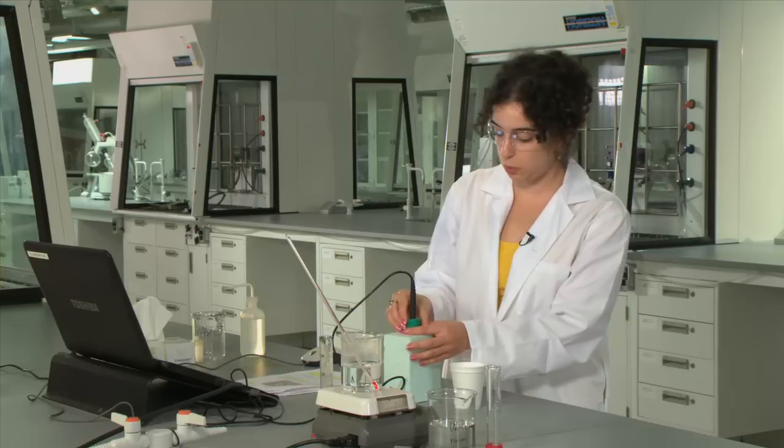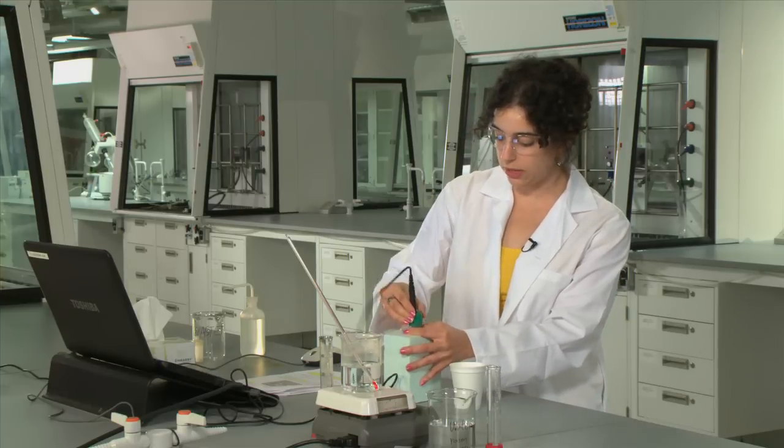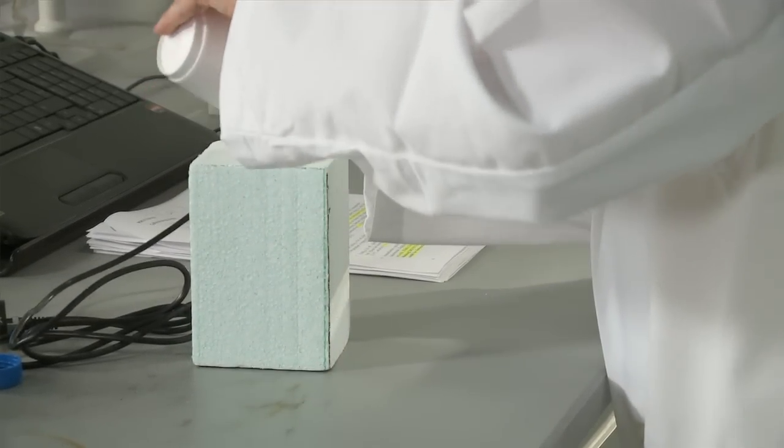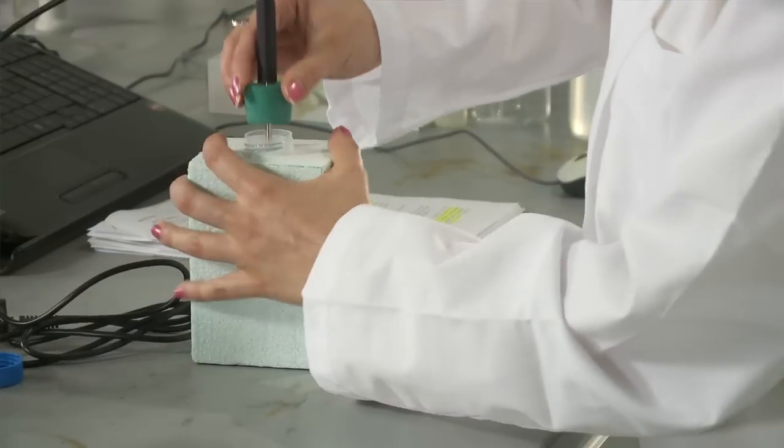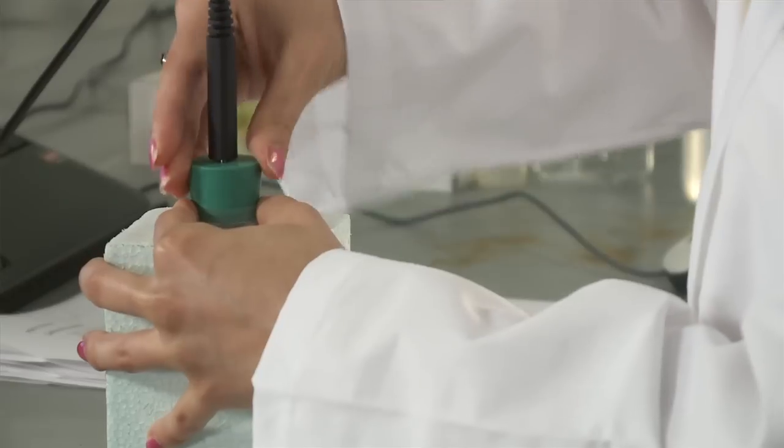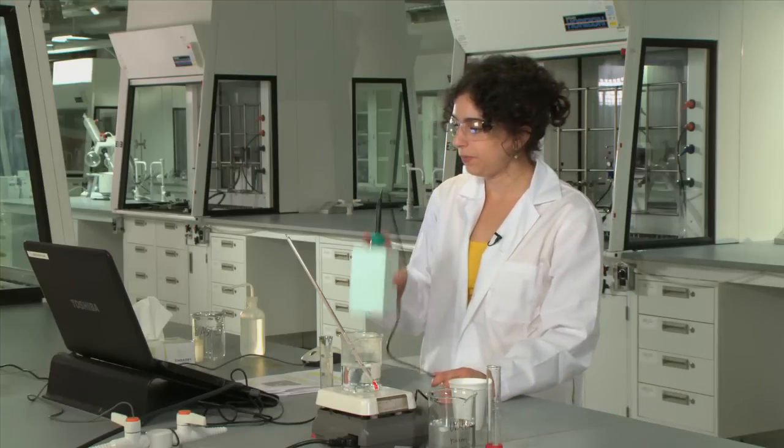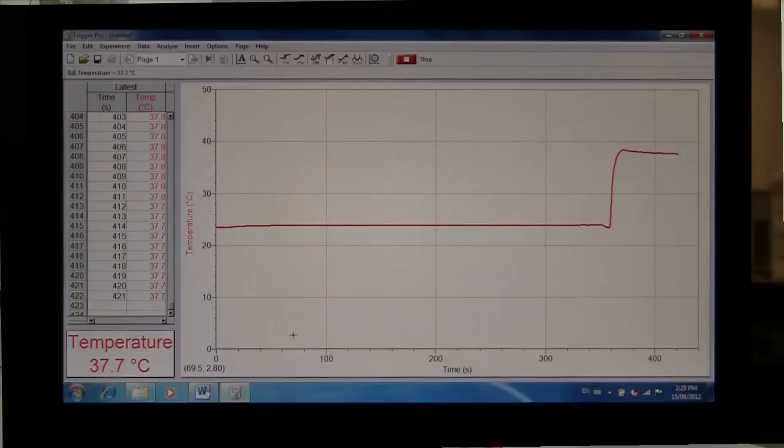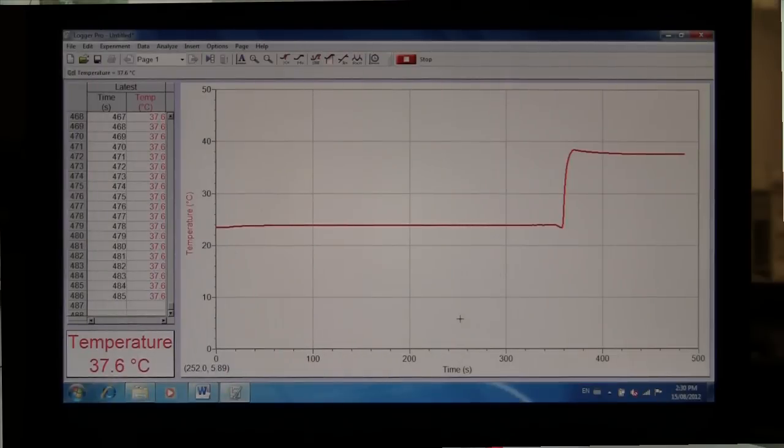And then immediately pour this water into your calorimeter again holding the calorimeter by the top of the tube, transferring this as fast as you can without spilling. Place the stopper and start counting 60 seconds. And then again you'll let it stand for 100 seconds just to allow the temperature to stabilize. Once 100 seconds have passed you'll record the temperature that is being measured, make sure that you write this down in your lab notebook and then you can click stop.